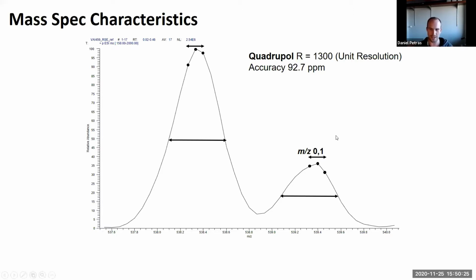So obviously, if you would now calculate a molecular formula from that, there would be many different possibilities of atoms that could fit in that window. Now if we compare this to an Orbitrap spectrum, that's of course way more accurate. Here in red overlaid, you see it's very precise.